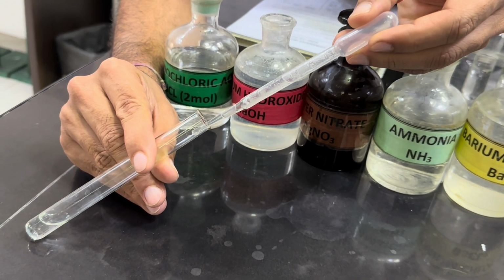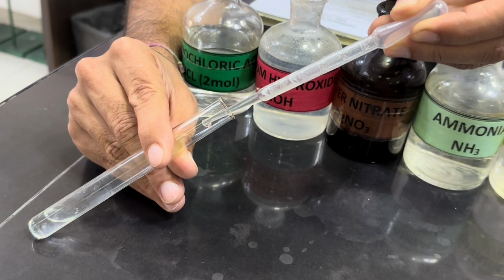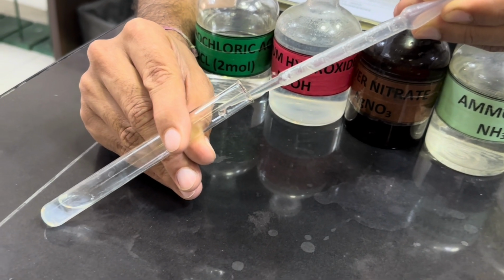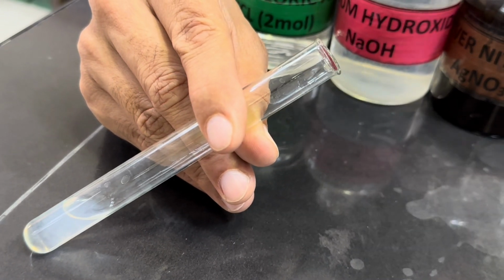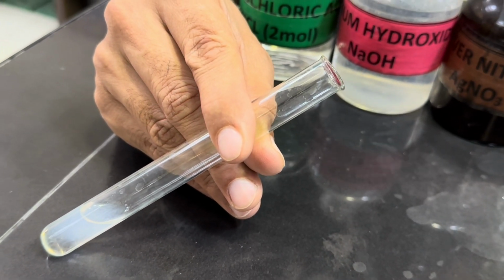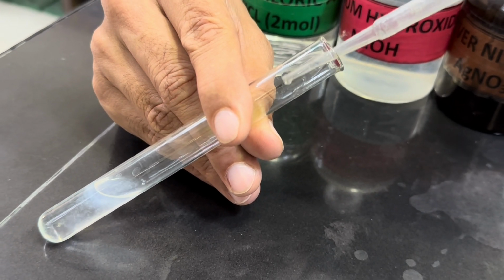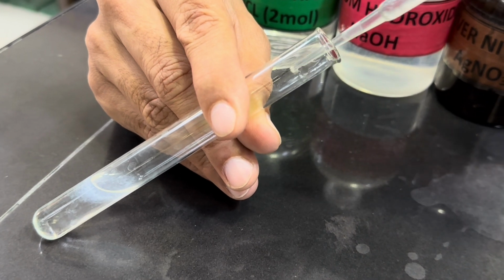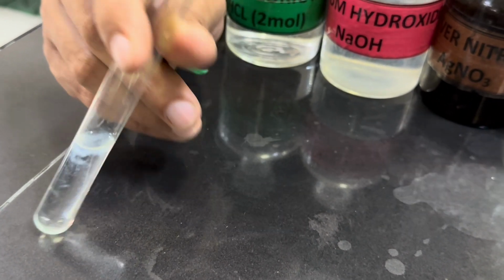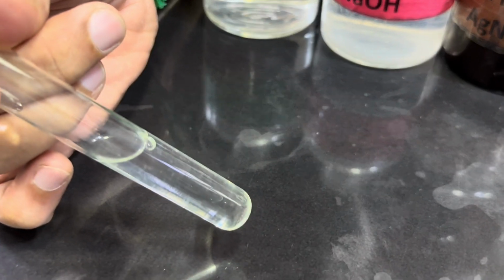As we add a few drops, we can see white precipitates are forming, and if we add an excess of sodium hydroxide, these precipitates are dissolving. So the solution is again turning colorless.